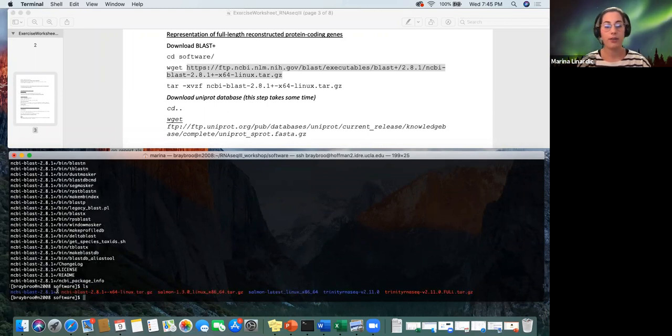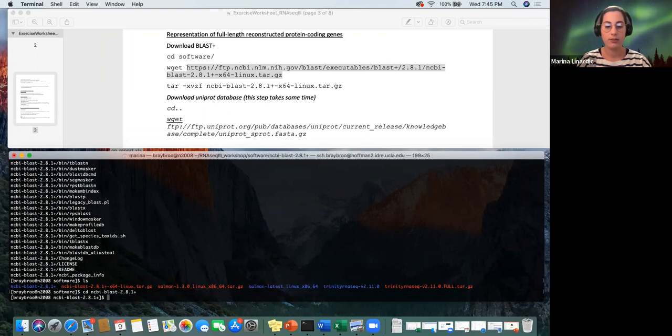Okay, so now we have it right here. If we go inside that directory, so 281 plus, enter.